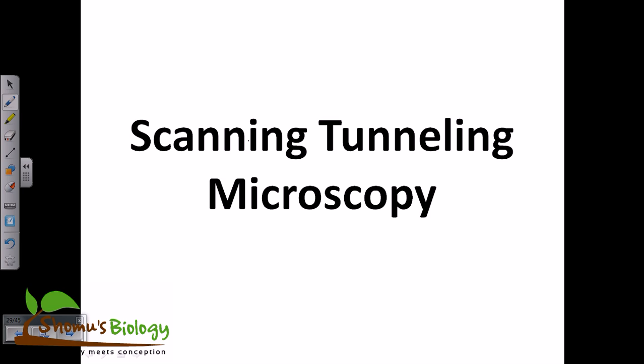the microscopy with the light source, right? They are called light microscopy or bright field microscopy, I can say. Then we have also seen that using electrons we can look at very high resolution images using scanning electron microscopy as well as transmission electron microscopy. So it's electron as a source.